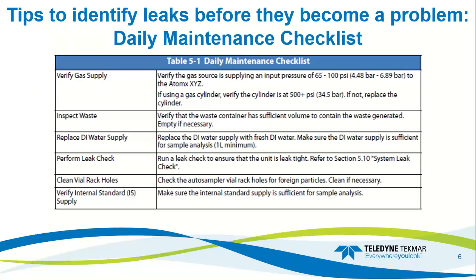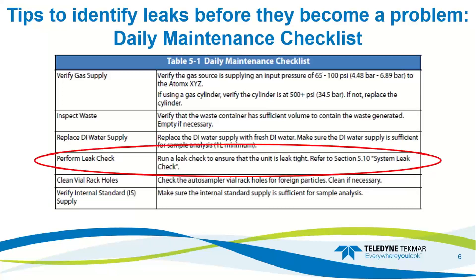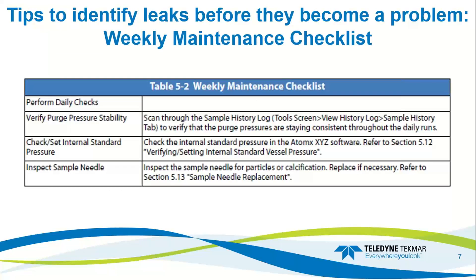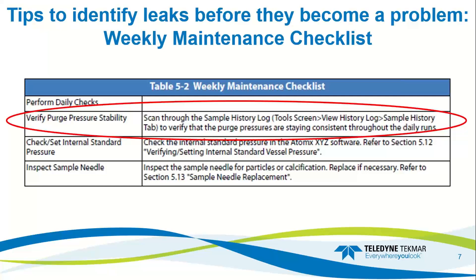Here are some tips to identify leaks before they become a problem. There is a daily maintenance checklist, and on this checklist one of the items is to perform a leak check. A carefully designed and faithfully executed preventative maintenance program is the best method for maintaining your instrument. It will help continue the performance standards of the unit and decrease the possibility of downtime. There is also a weekly maintenance checklist, which includes all of the items from the daily maintenance checklist, and it also suggests that you go through your sample history log to verify the purge pressures stay consistent throughout daily runs.